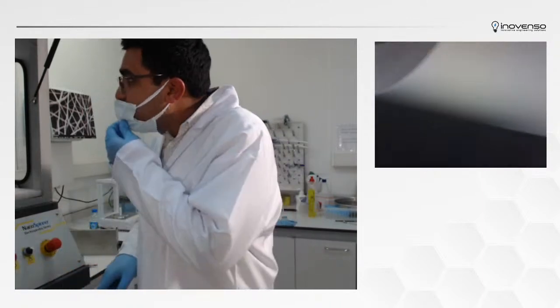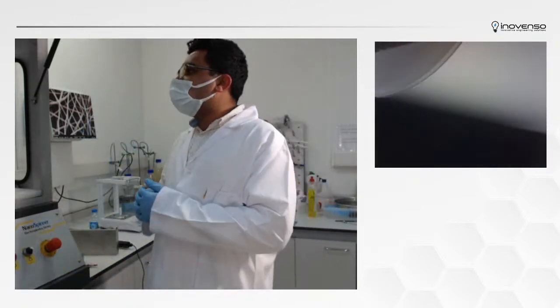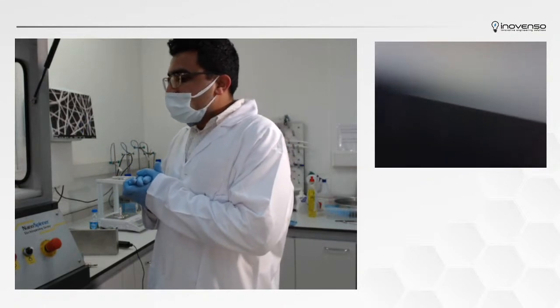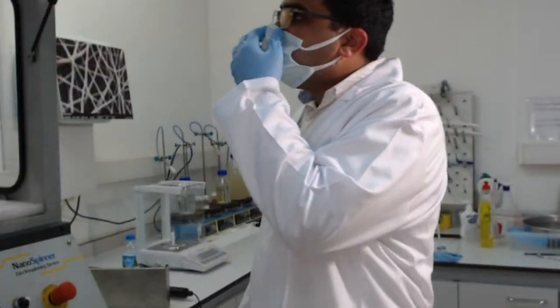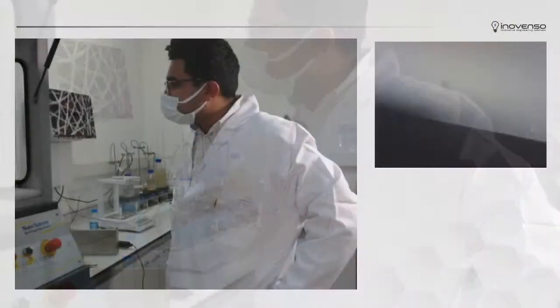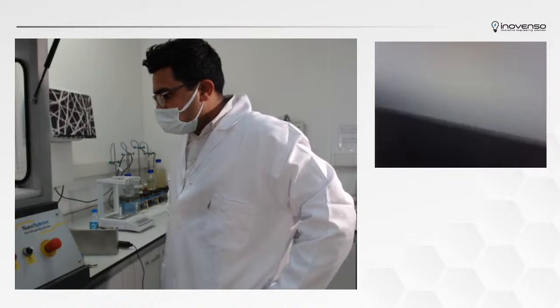Let's increase the RPM to make it more. So now you can increase the RPM up to a maximum of 2000. There are other parameters you can affect, like suppose the spinning distance is too small and the solution is leaking. You can also increase that manually from here. So I think this basically covers what we were going to discuss today.